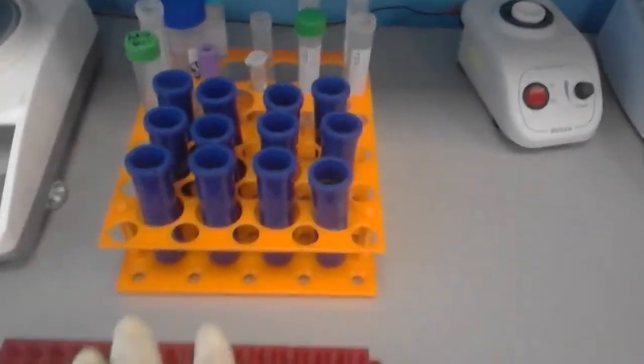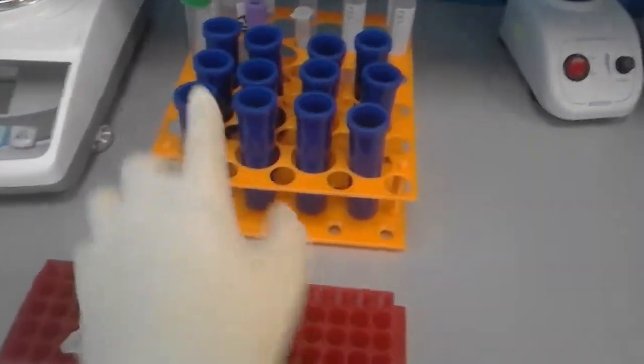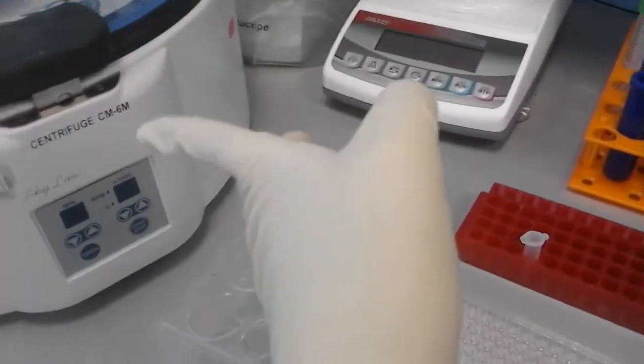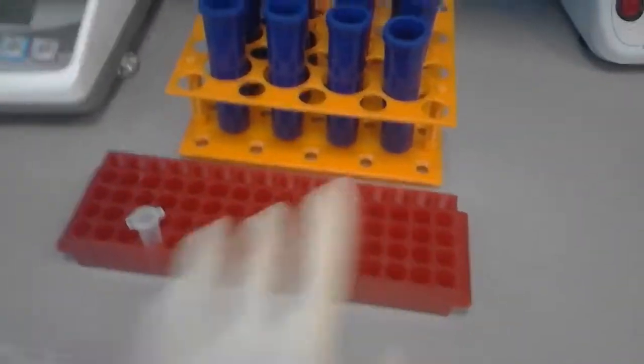Test tube racks. These are some test tubes used here. These ones are actually from the centrifuge here, and they're smaller ones.